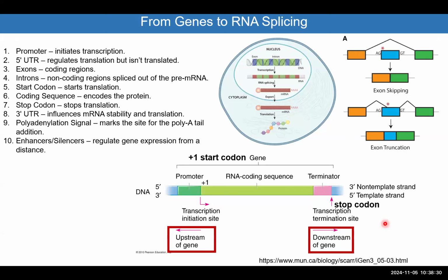So again, this slide is copied 2 times just to remind you for one last time that when we are doing qPCR, we are designing primers within the exons.